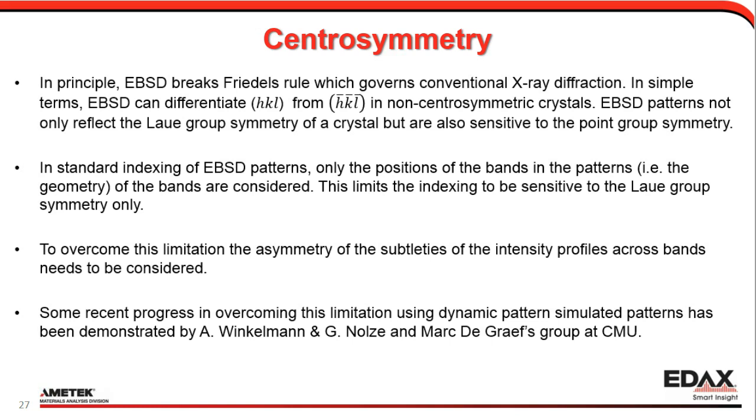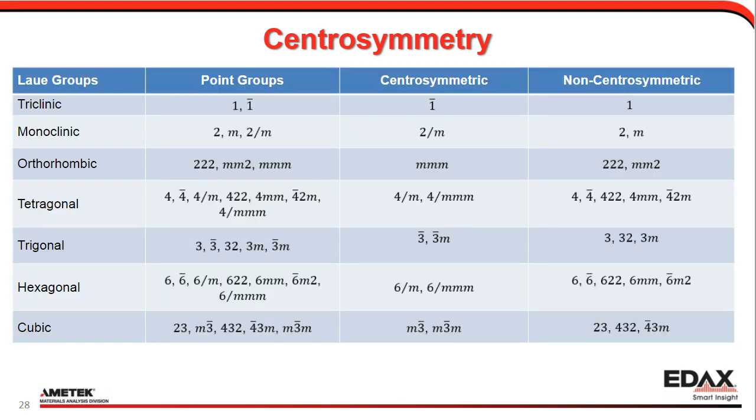So to overcome this, we would have to look at intensity profiles. And some recent progress is starting to be made by those groups who focus on dynamic pattern simulation. Aimo Winkelmann and Gert Nolze have done some work together, and I'll show you an example, as well as Marc De Graef's group at CMU have done some experiments here. So these are all the point groups, just showing you which ones are centrosymmetric and which ones are non-centrosymmetric.